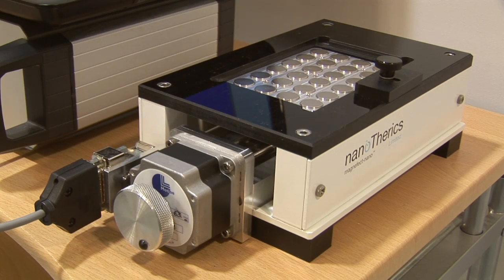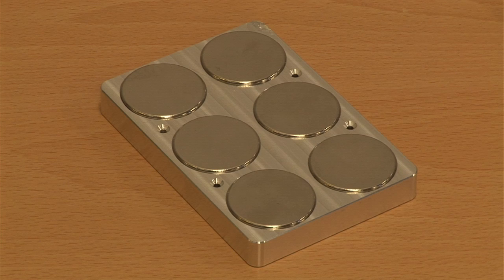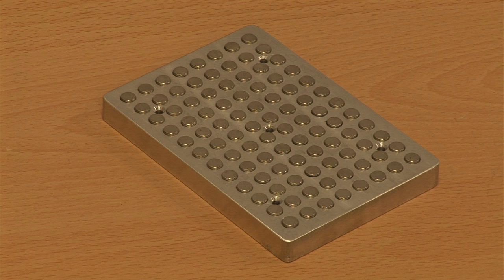For further flexibility, the magnet array on the Magnafect Nano is fully interconvertible with 6-well, 24-well and 96-well arrays available.